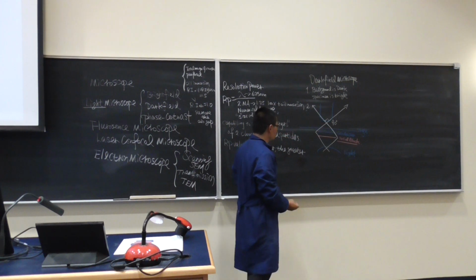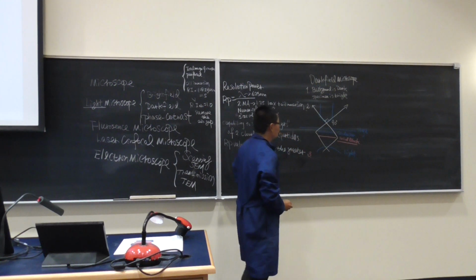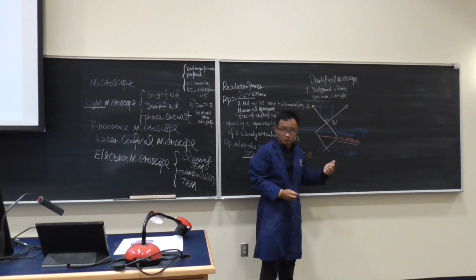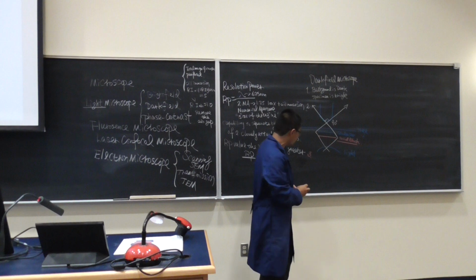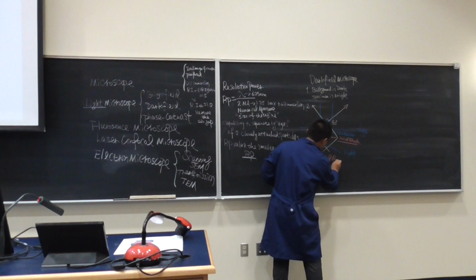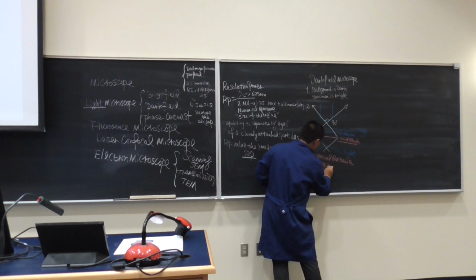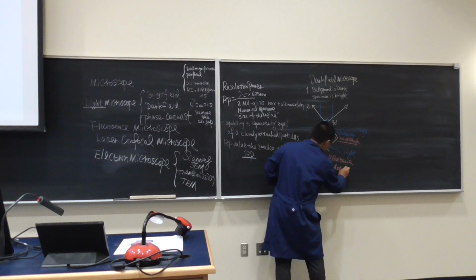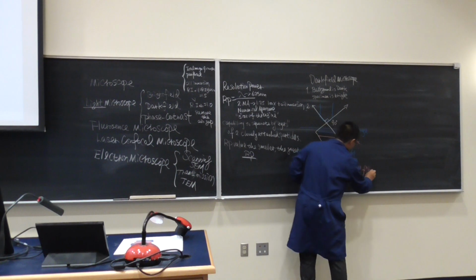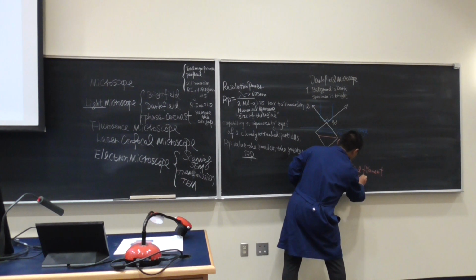So the third question will be, why is the dark field microscope so important? Why do we use it? Because there is one group of very special bacteria, very important in the clinical area, we call them spirochetes. Spirochetes are flexible filaments moved by endoflagella.